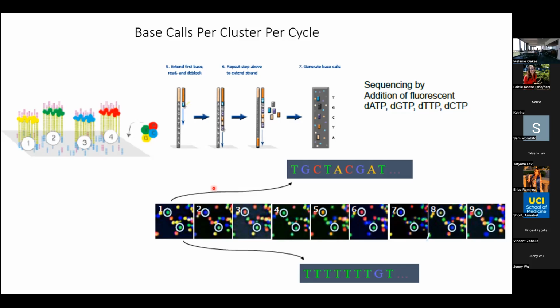And that would be for messenger RNA enriched. If we were doing total RNA, meaning that we depleted all of the ribosomal RNA and everything left is poly A or long non-coding or whatever, then we might want to sequence more too, maybe up to 50 million. So this is what we mean by read depth.